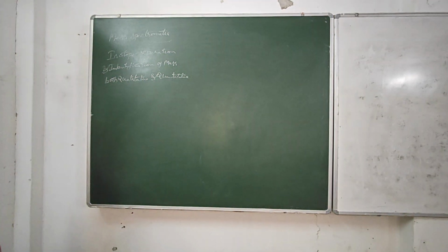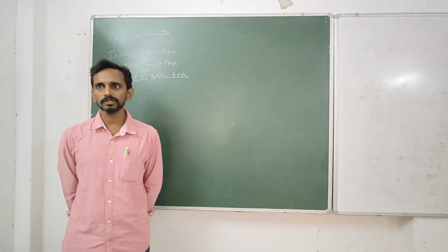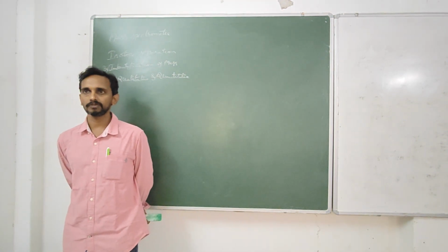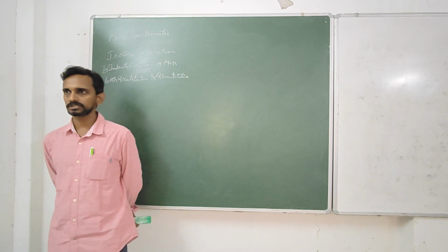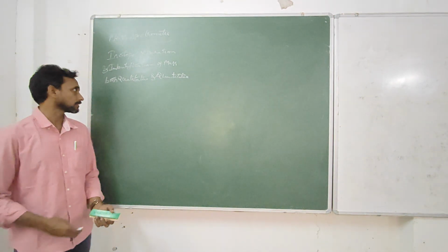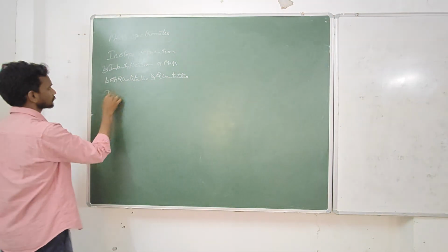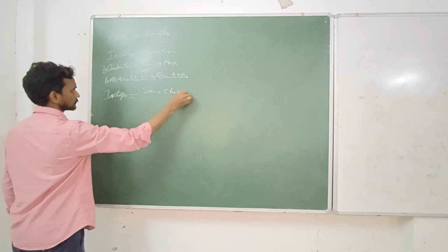Okay. So the first thing is, what are isotopes? Same proton number, different neutron number. So, in the presence of an electric field, both of them behave in the same manner. Since the charge is constant for all the isotopes, all of them behave similarly in the presence of an electric field. So the alternative option is to use a magnetic field. Isotopes contain the same charge, different mass.